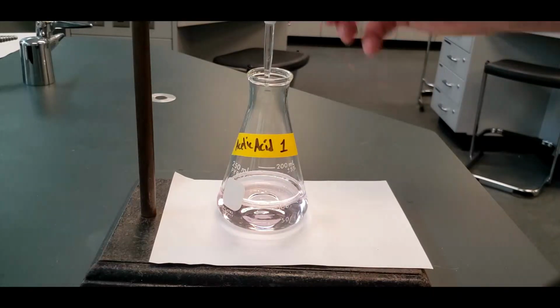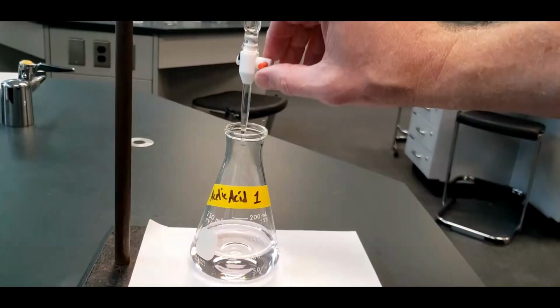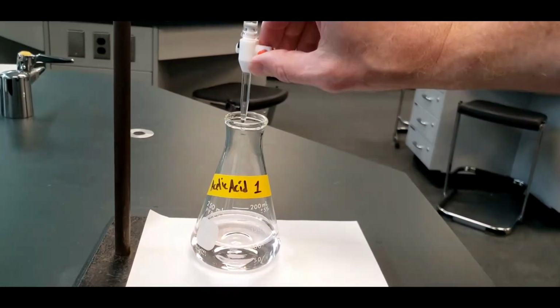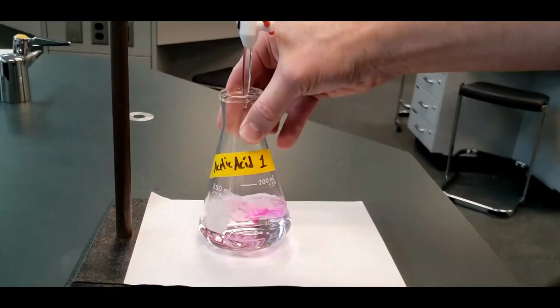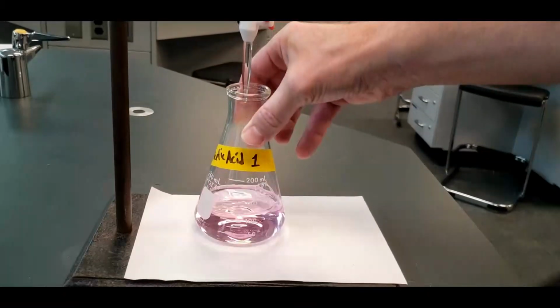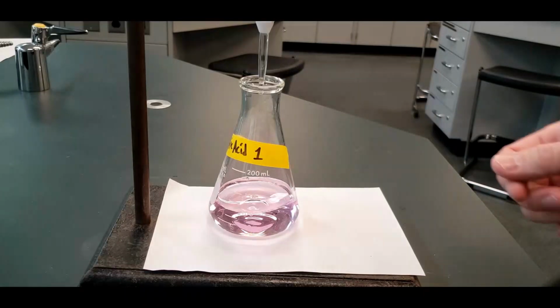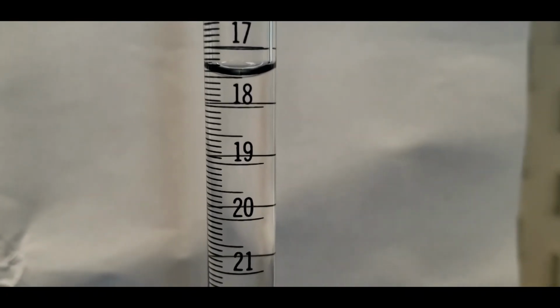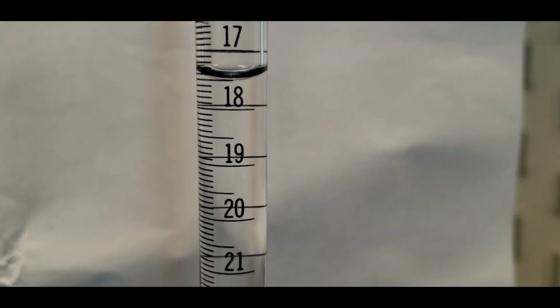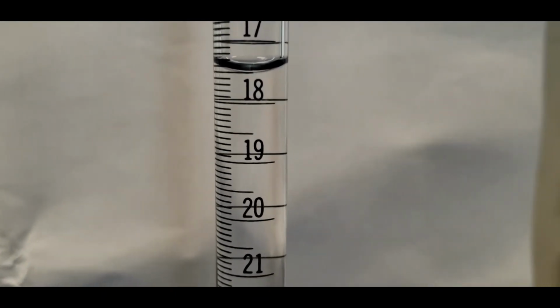So what you want to do when you're that close, you just flip it once. You just do this really fast. Flip. It looks cool, or as cool as we get in chemistry. And that puts in about a drop, and that's all we needed. Okay, so let's see what the volume was. All right, so I'm thinking it's 17.48 for the volume for the first acetic acid unknown titration.